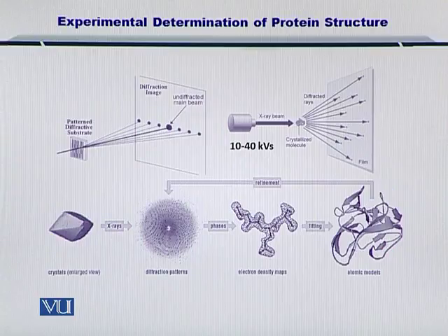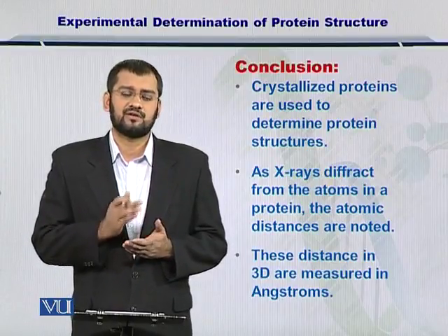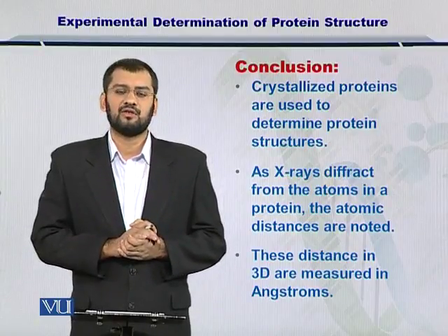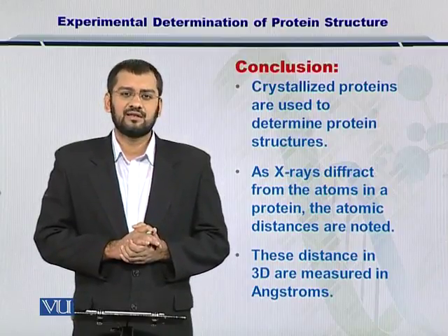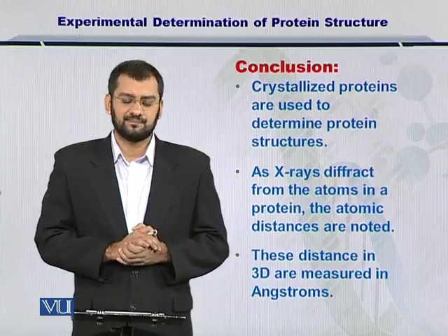This is the experimental background of X-ray diffraction and X-ray crystallography towards measuring the protein structure. One important thing to remember here is that the proteins which are crystallized can give you the structure using this technique. But what if your protein is not liable to being crystallized? In that case, you cannot use X-ray crystallography because then there will be no diffraction pattern.